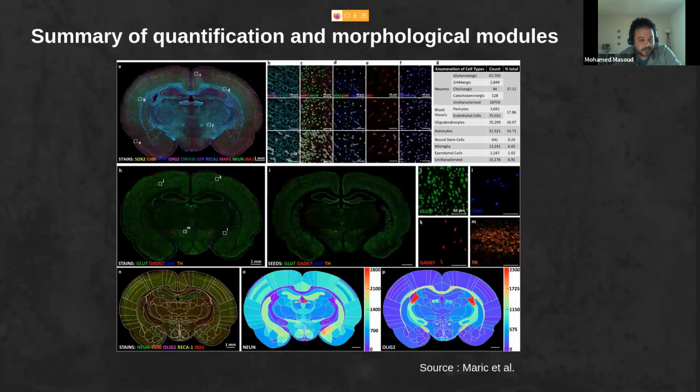And the final part they covered in the paper is, after they get the bounding boxes of all the detected cells and get the main types on the tissue, they go to get the subcellular compartments of each cell, which include the nucleus, the soma, and the membranes.